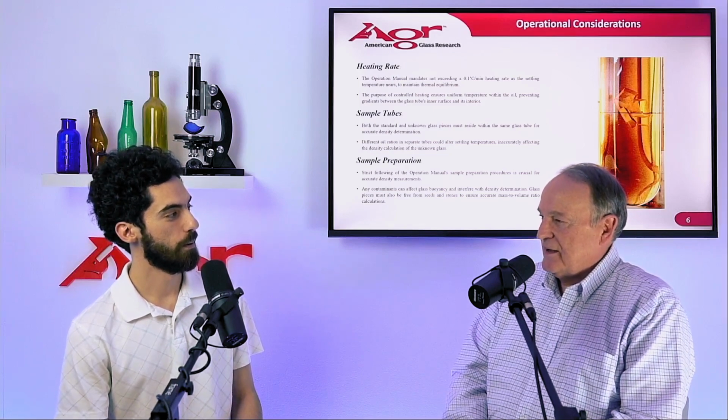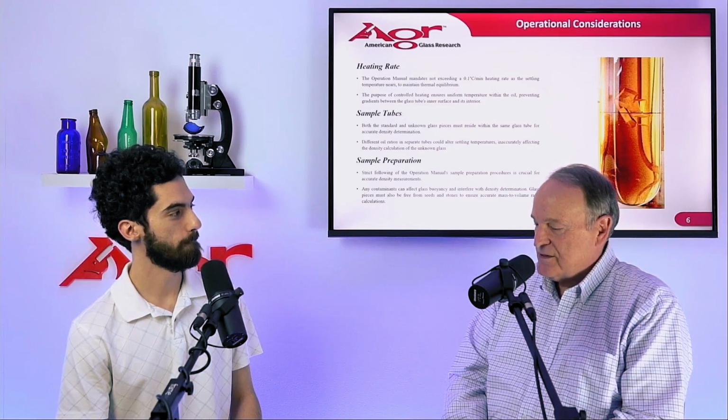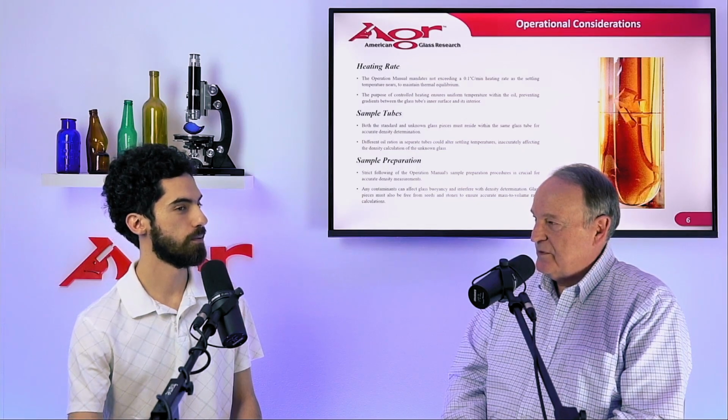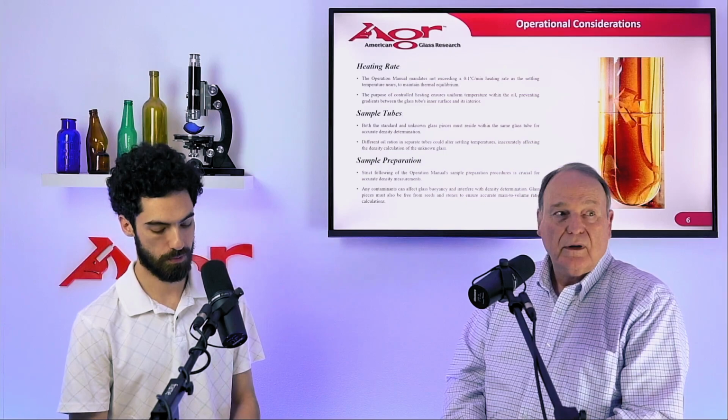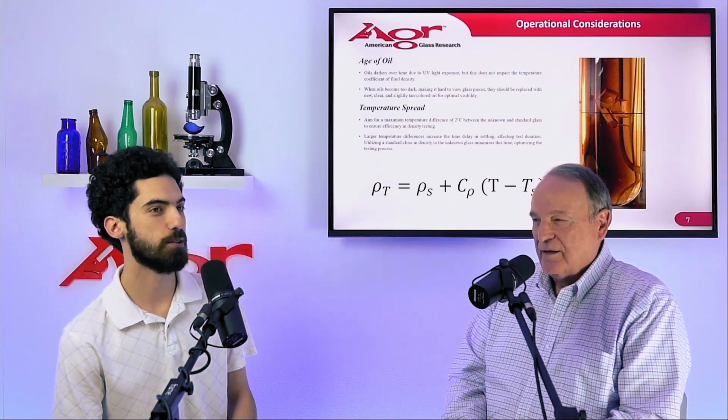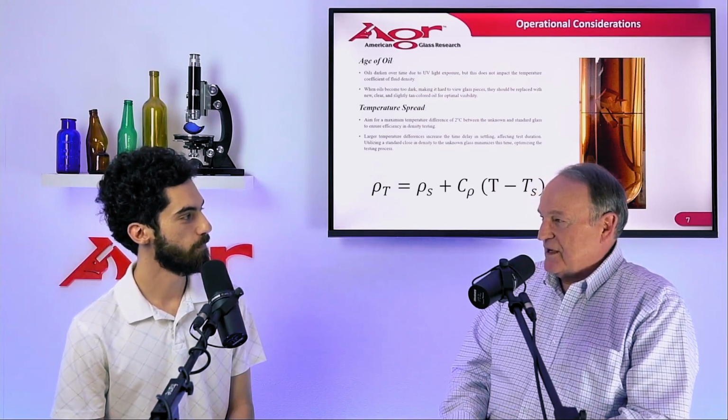So let's go to that in our next concept, the difference in temperature between the standard and the unknown. I believe we called that the temperature spread. We can jump around, that's all right. Yeah, let's do it, because it's germane to this discussion right now.